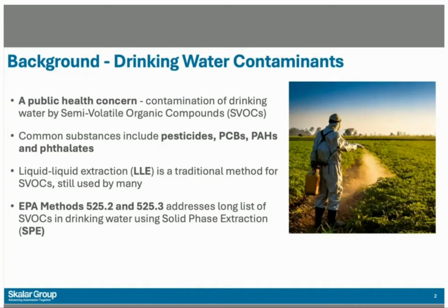Now for the SVOC methods, traditional approaches with a separatory funnel is a very common method still used today. I say traditional because it has been around for a while, but of course there are really fascinating innovations going on as well. Saw some talks earlier this show, Johnny Mitchell, Julian Martinez, taking really interesting new steps towards liquid-liquid extraction.